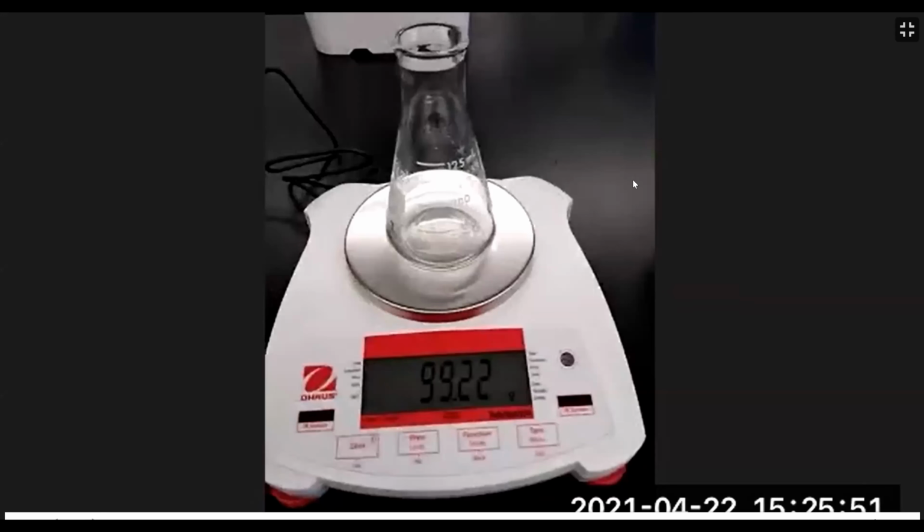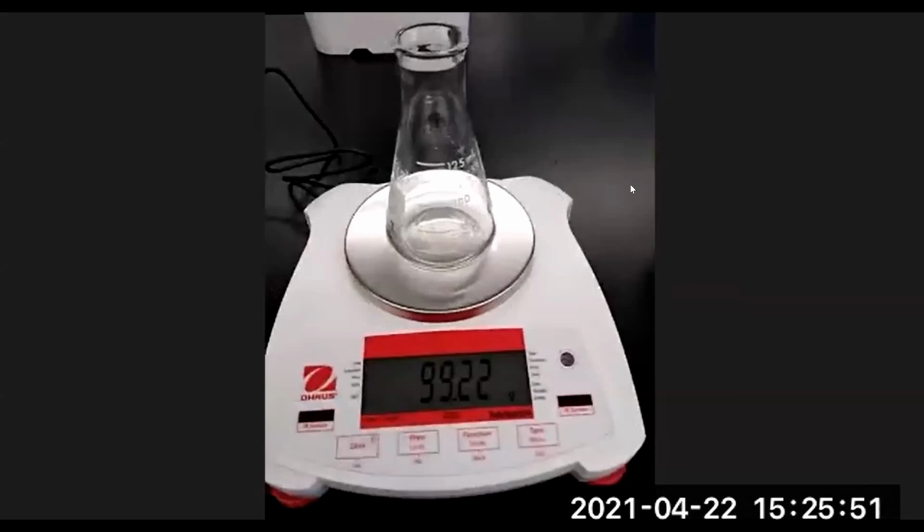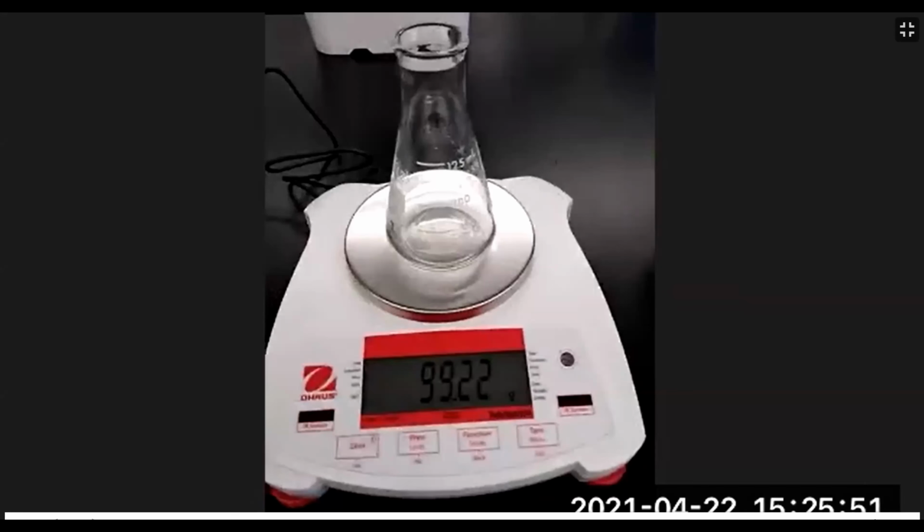So the first thing you want to do is record the mass of the 125 milliliter Erlenmeyer flask. So it's 99.2 grams. So let me write that here to the side.